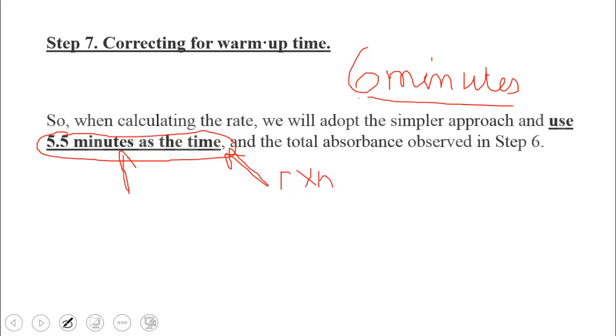So you do need to use a reaction time of 5.5 minutes, not the actual 6 that the test tube was in the warm water bath.